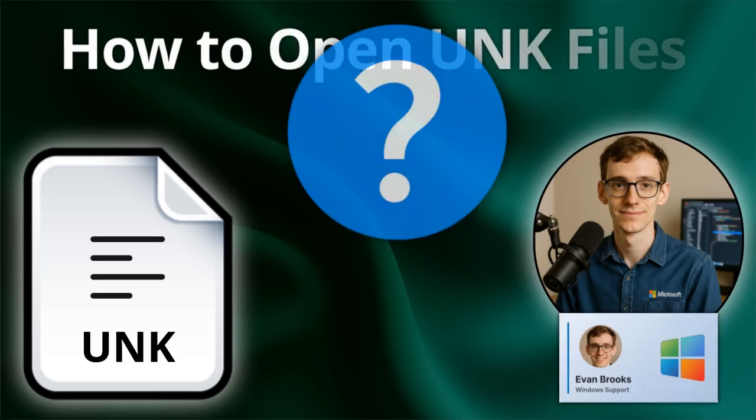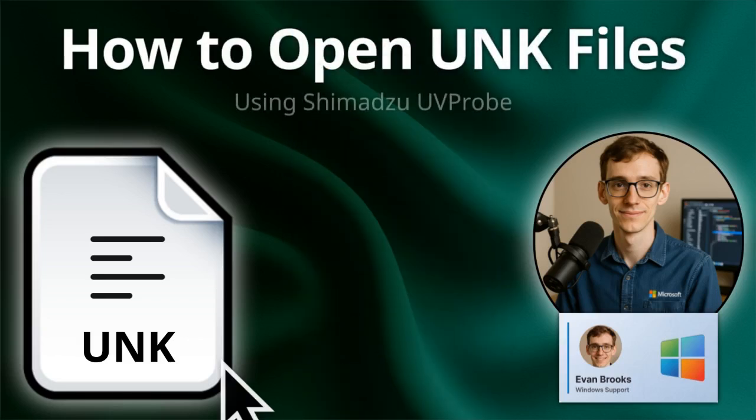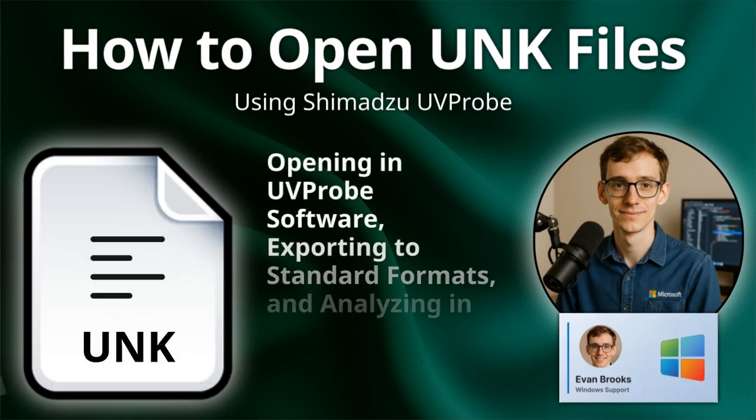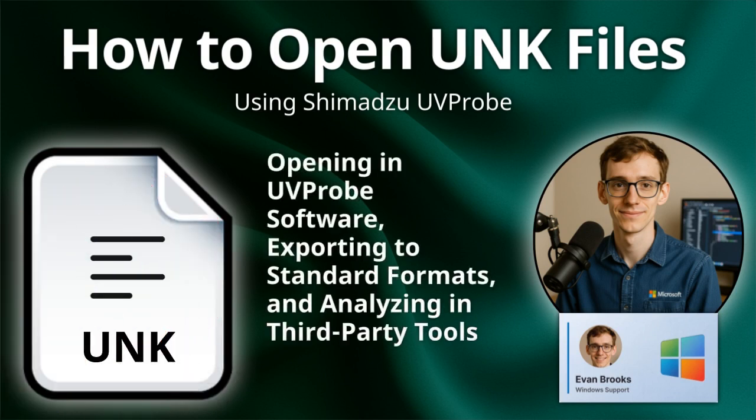Got a UNK file from a Shimadzu UVProbe spectrophotometer. This contains spectroscopy measurement data from laboratory analysis. I'm Evan Brooks, Certified Support Engineer, and I'll show you how to open and analyze these UVProbe data files.